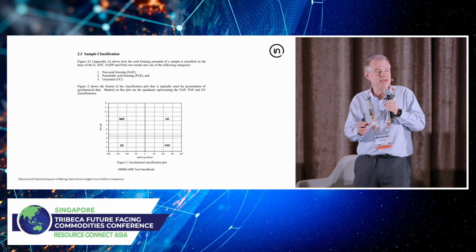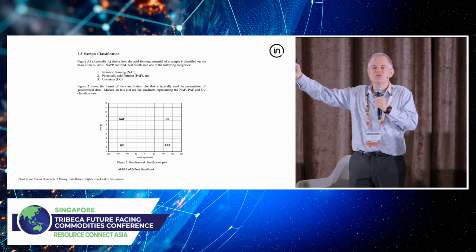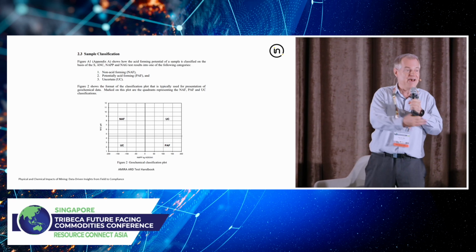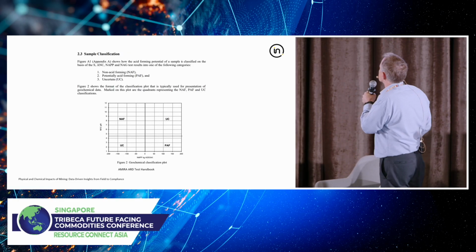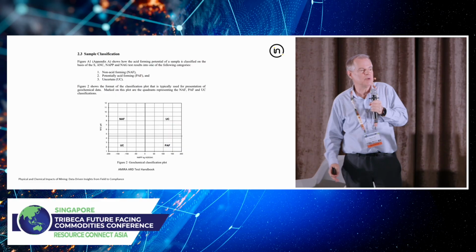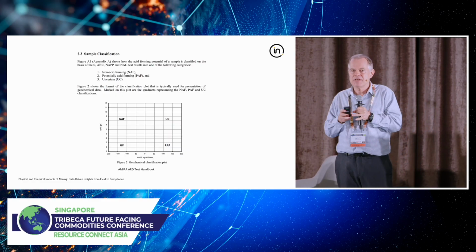And that actually makes us, the laboratory, very happy, because we have to do all kinds of additional testing for the mine in order to determine if that rock is finally NAF or if it's PAF. And that, in a nutshell, is examples of some of the tests that we perform for the mines so that they can help monitor the impacts they have on the environment.